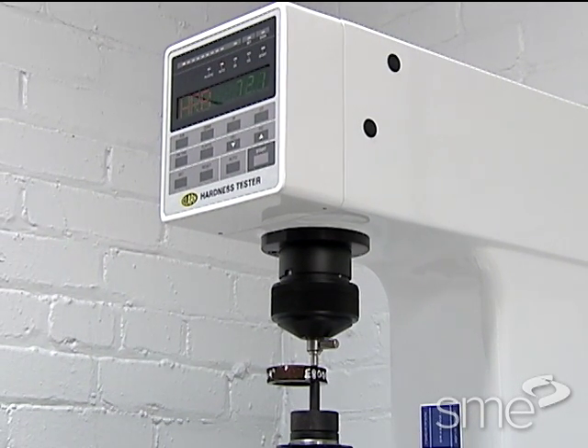The difference between the minor and major penetration depths is then noted as a hardness value, read directly from a dial or digital readout.